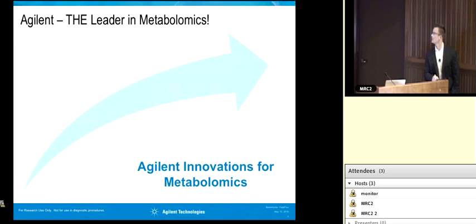As a second component of that, you heard a little bit about isotopologues and isotopomers. This software at this time, the first release, is going to deal only with isotopologues. And this is for 2 reasons. One is because it's very computationally challenging to do isotopomers. As you heard, it requires MSMS, GCMS, NMR. And the feedback we got from our collaborators is there's a lot of information we can glean from isotopologues.